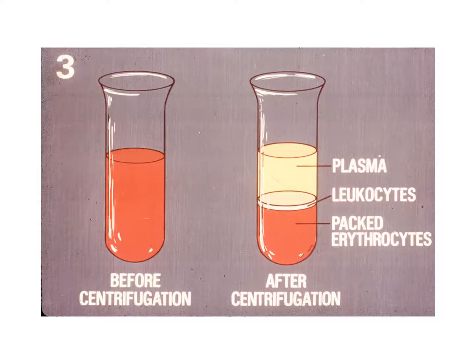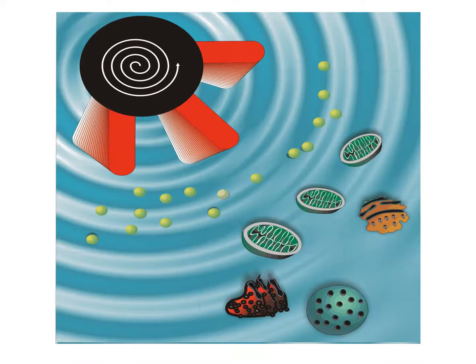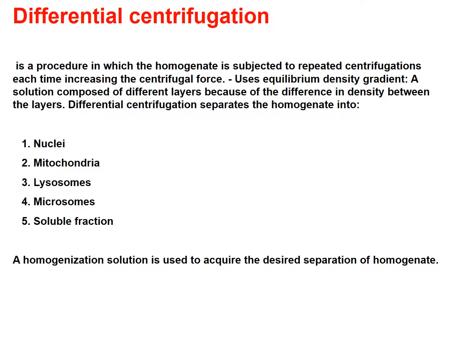And this is just another cartoon. So before and after centrifugation, quick centrifugation. And so you can measure somebody's hematocrit, the amount of red blood cells, just with an estimation of how much you see. How is this layer here? How thick is it? Okay, so you can get some good clinical information, just a real quick spin, just a look-see spin. And then here's just the centrifugation model we talked about.